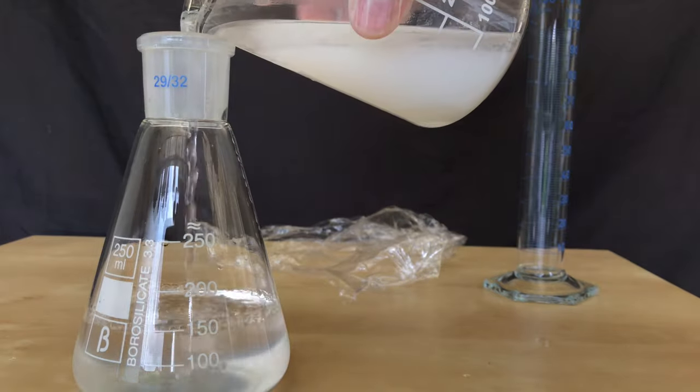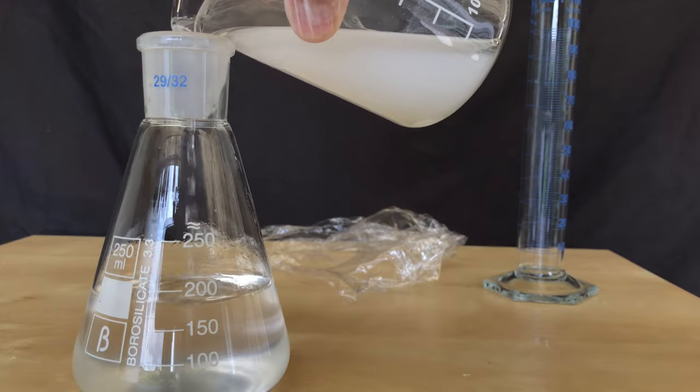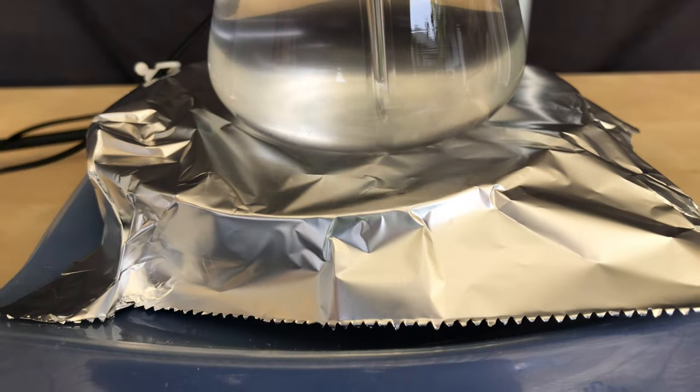For the next step I had to be careful. I decanted over the ether layer while leaving behind calcium chloride solution. Some more ether was added and also decanted off. Time for the next step.